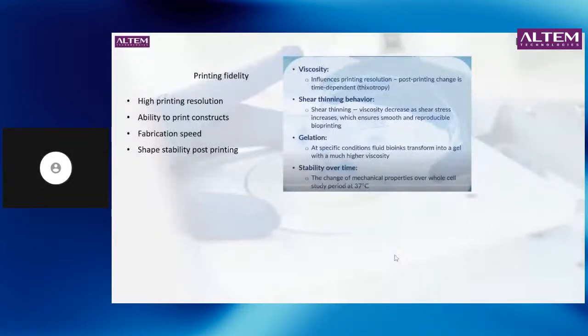If you have high temperature, the possibility is that the viscosity will lower as time progresses. So selecting the right temperature of printing or the right pressure of printing becomes important. Now the stability over time is another factor. The change of mechanical properties over time, basically the conditions of temperature while you're printing, also play a very important role.